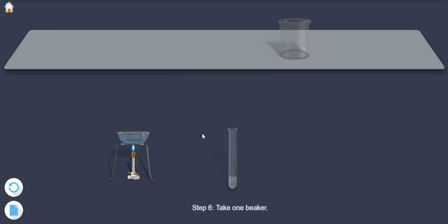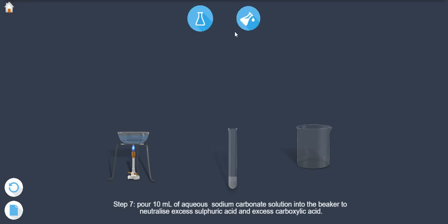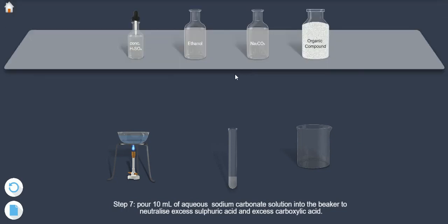Step 6: Take one beaker. Step 7: Pour 10 ml of aqueous sodium carbonate solution into the beaker to neutralize excess sulphuric acid and excess carboxylic acid.